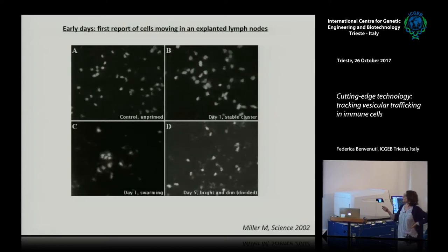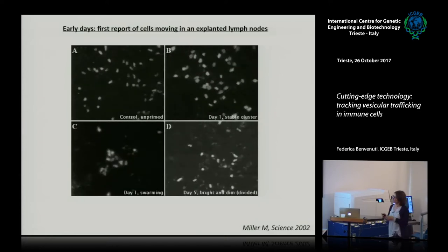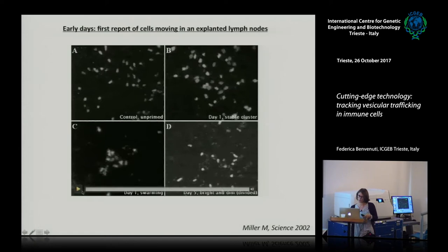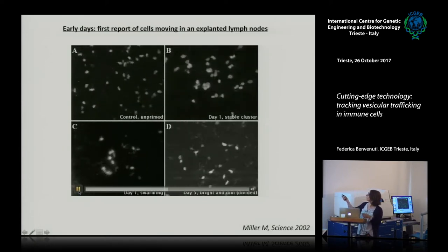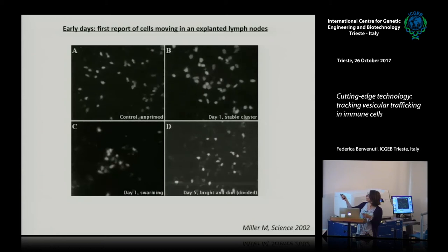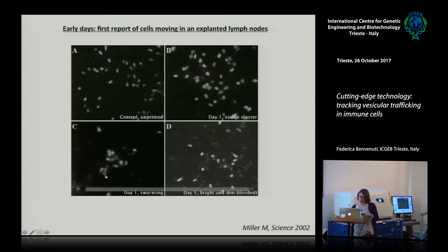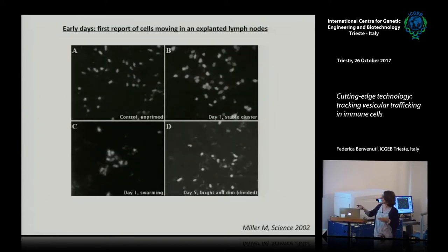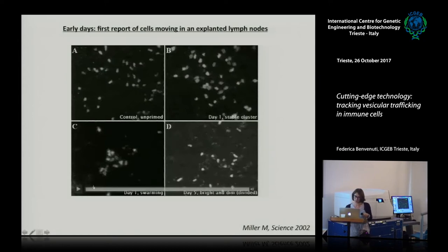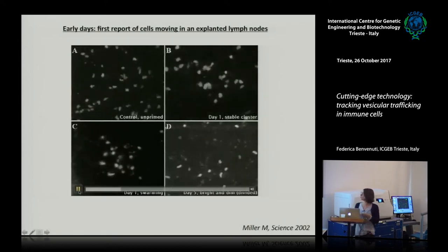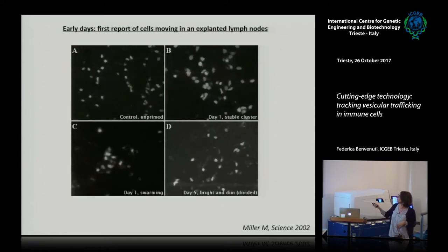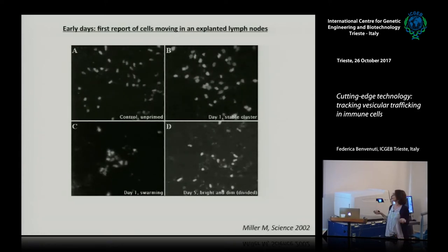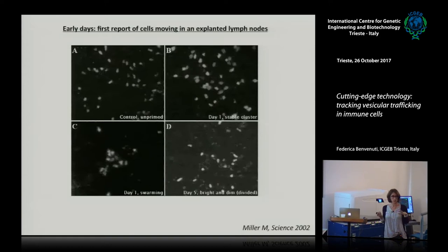If you immunize the animal, one day after immunization you do see that cells begin to form clusters and they don't move very much anymore. These dynamics were called stable clusters versus swarming. If you wait a little bit longer at day five, the cells begin to move again and begin to divide — you have some dim cells that are divided T cells. This was great at the time because it was the first time that T cell priming and proliferation was recorded in vivo.